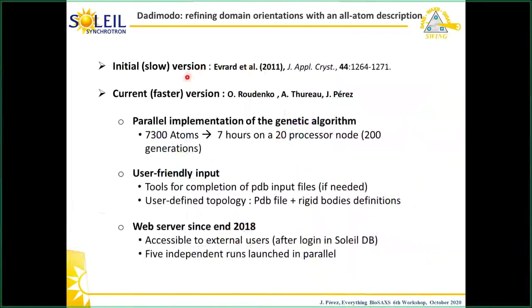So the initial version, again, ran on a single computer. It was written in 2011 by a postdoc, Guillaume Evrard. And since then, Olga Rudenko, who works at Soleil as a software engineer, she's a mathematician again, parallelized it, and we gained, it's 100 times faster now.